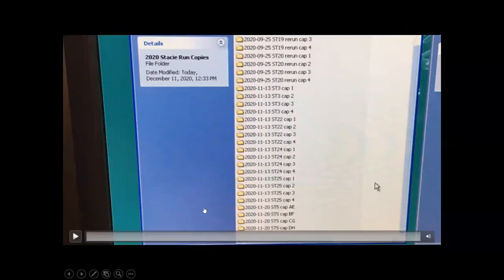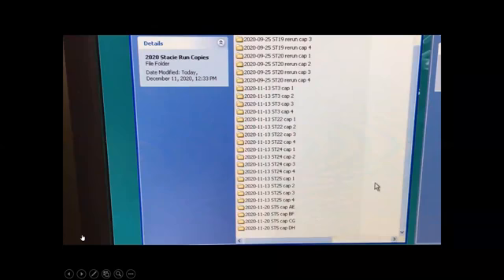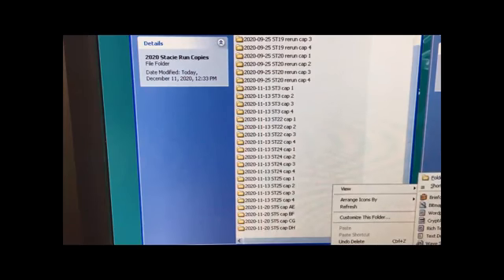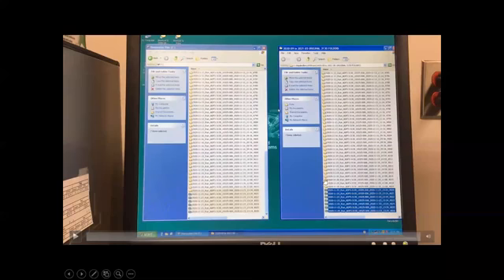All right, so what I'm going to do here is, am I going to show you how I got there? Oh, great. Probably one of these files is out of order. Damn it. I skipped ahead one.